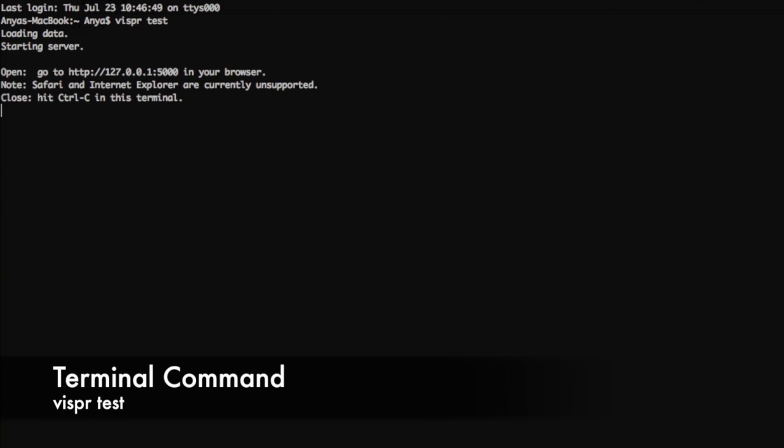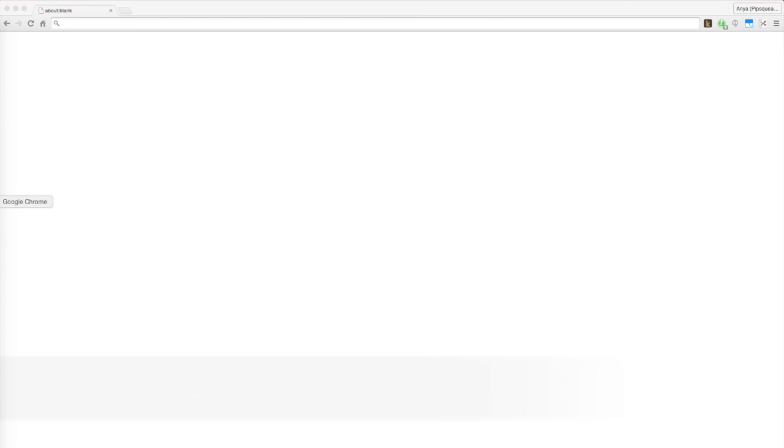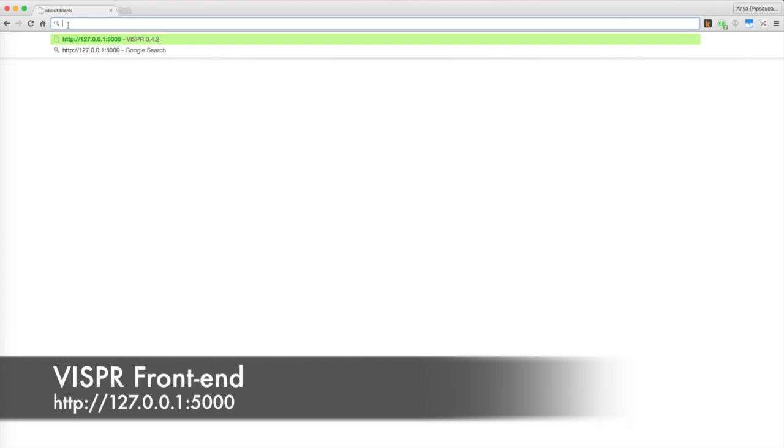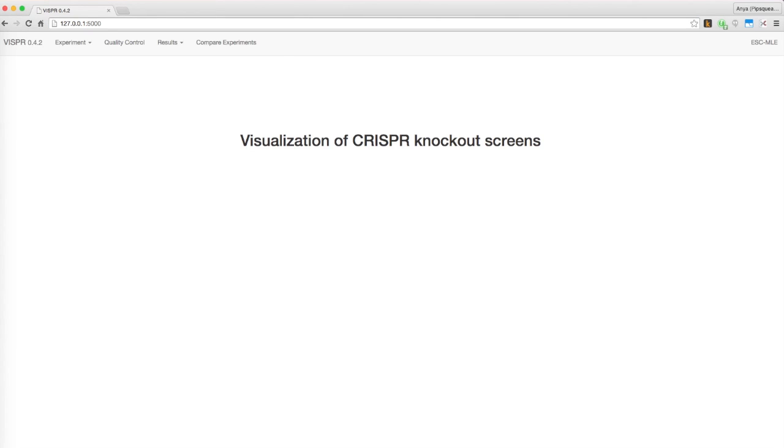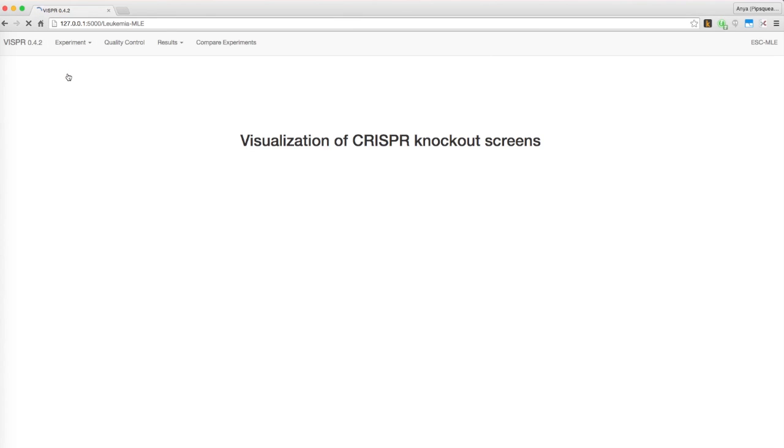Again, open up the Visper demo by running Visper test or by following the directions in the configuration file. However, we recommend the first method for this video so that you can see Visper's capacity for handling multiple experiments with multiple conditions. This time, under experiments, choose the leukemia dataset.